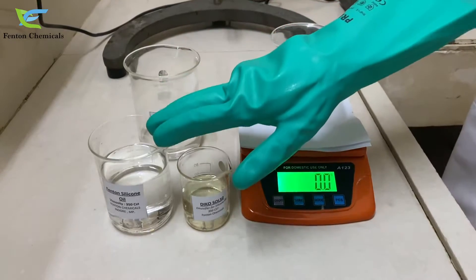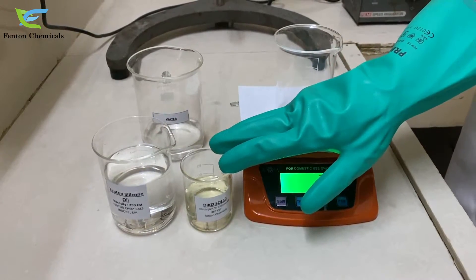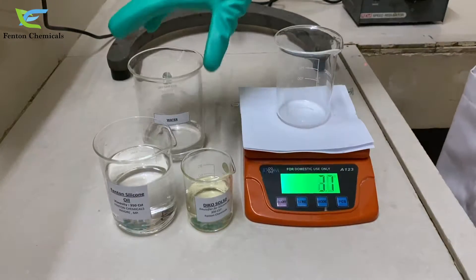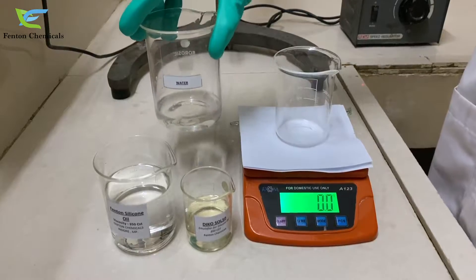So here we have with us silicone oil 350 CST, emulsifier for silicone oil Decosol 50, and 70 grams of water that we will add to make a 100 gram silicone oil emulsion.